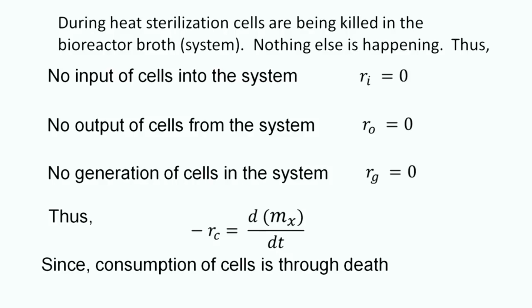The consumption of cells is through the death of cells as they are getting exposed to the high temperature. Remember, this is the heat sterilization that we are talking about.